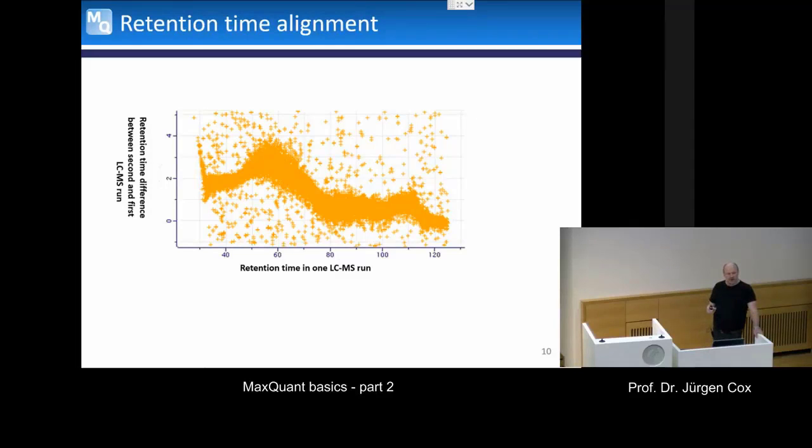So it's a little bit like hierarchical clustering. It is actually hierarchical clustering of the samples. So it builds up a cluster tree of all of the samples. And then in this tree, from bottom up, basically it first clusters together the samples that are most similar and then goes to the top.